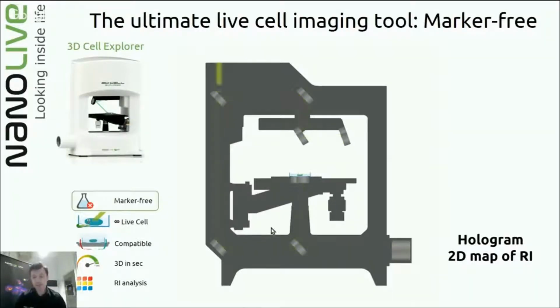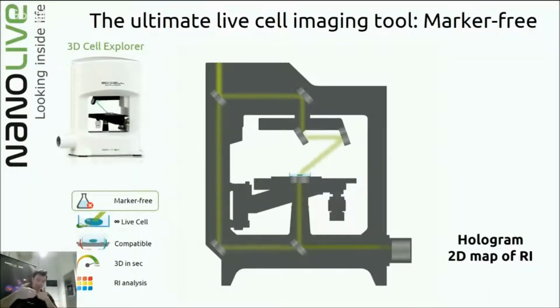Now, since the laser is in phase, the front of the wave progresses at the same speed. When the sample beam interacts with the sample, part of it will be retarded. When it conjoins with the twin beam at the bottom, we will be able to understand how much it has been retarded thanks to the interference of those two beams, which is recorded on the hologram.